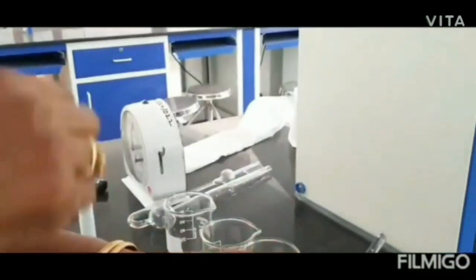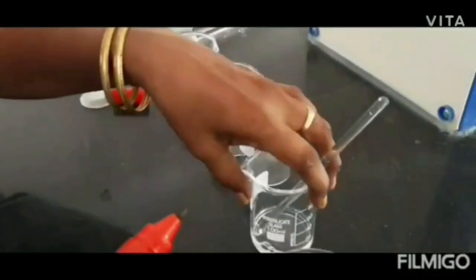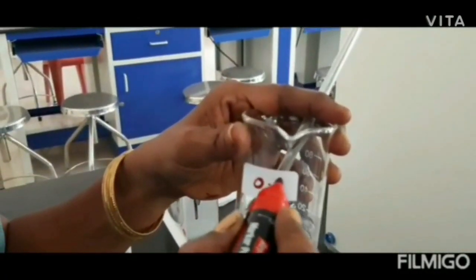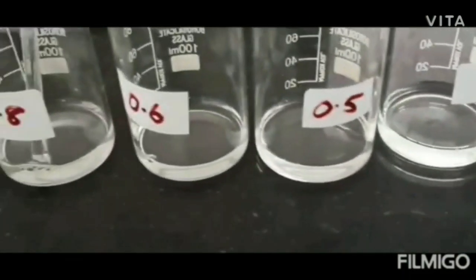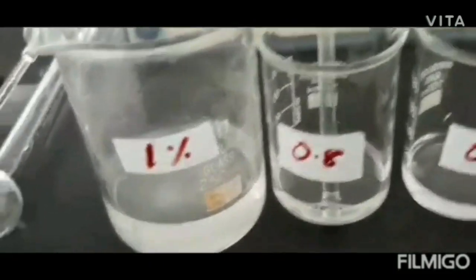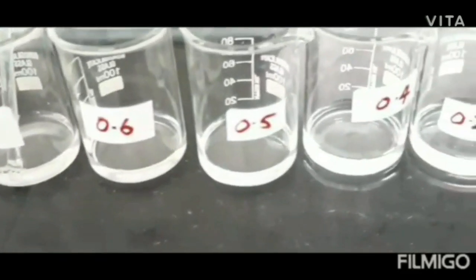Transfer it into a beaker and stir it well. The PVA solution should be thoroughly mixed with the water. Now the concentration is 0.4, so it has to be marked as 0.4 concentration. In the same way, the other concentrations, that is 0.5, 0.6.